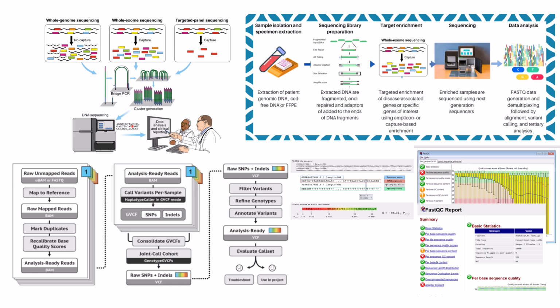Absolutely fundamental. It ensures efficiency, it ensures consistency, the same steps are run the same way every time, and it ensures reproducibility. It's what takes the incredible power of genomic sequencing and translates it into information that can actually guide critical clinical decisions in this era of precision medicine. It's just remarkable when you think about that whole transformation from these invisible bits of data in a patient sample all the way through this complex digital refinery to a filtered, annotated list that a doctor or genetic counselor can actually use. It truly is. The automation is key to handling the sheer scale and complexity. Without it, analyzing this data would be practically impossible on a large scale.